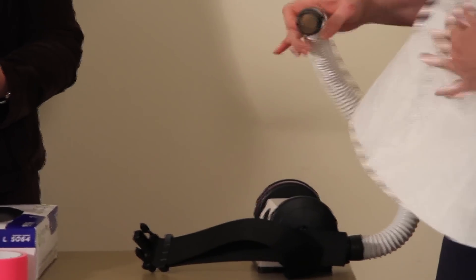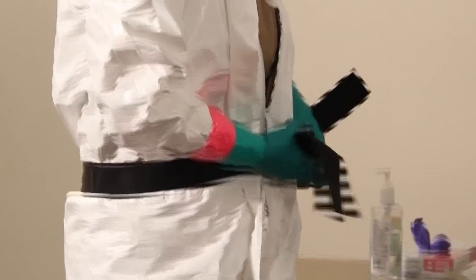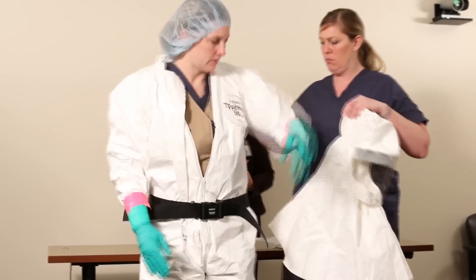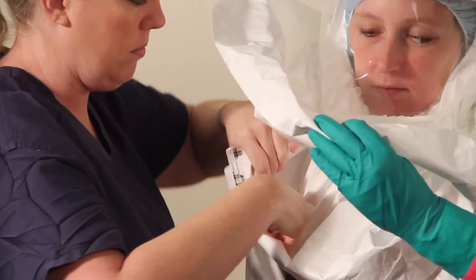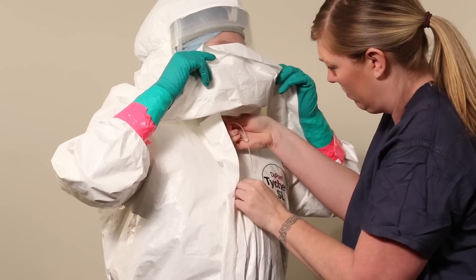Turn on and test your PAPR to make sure it's working, then turn it off and wrap the PAPR belt around your waist. Cinch the belt until it's comfortable for you. Connect the hose from your PAPR to the hood and turn it on. Place the hood over your head and tuck the inner apron into the suit. Zip and seal your suit completely.